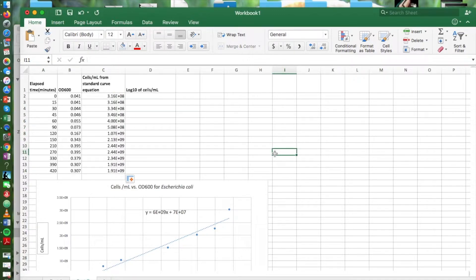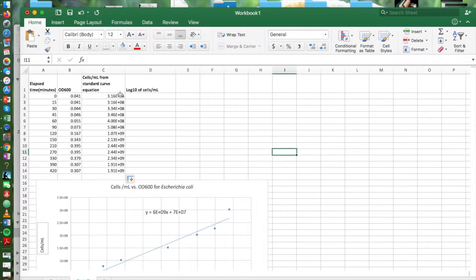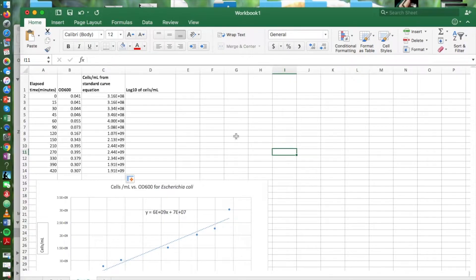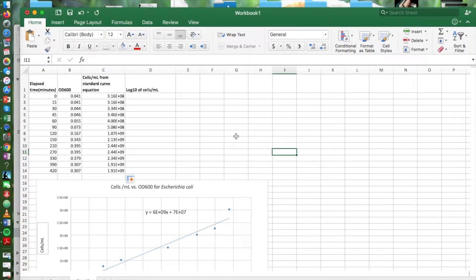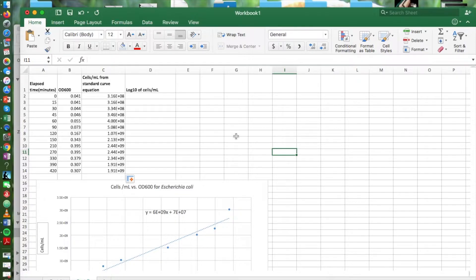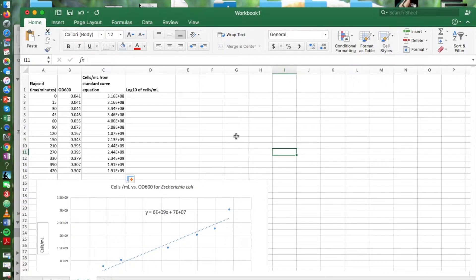Now we're going to plot the log of the cells per ml against our time points and we're going to use the log because the numbers are so big and also because it will show us where the exponential phase of the growth curve is as we'll see in a moment.